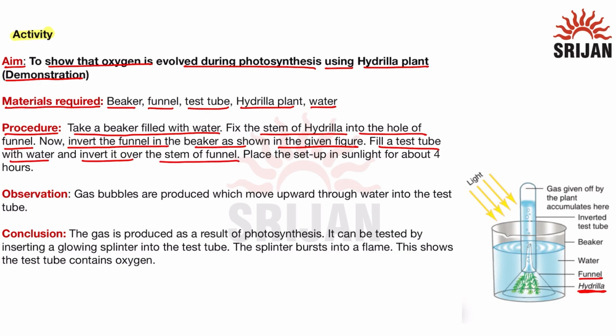And we can see in this figure that the test tube is filled with water and is inverted over the stem of the funnel. So the beaker is filled with water, and we place the setup in sunlight for about 4 hours.